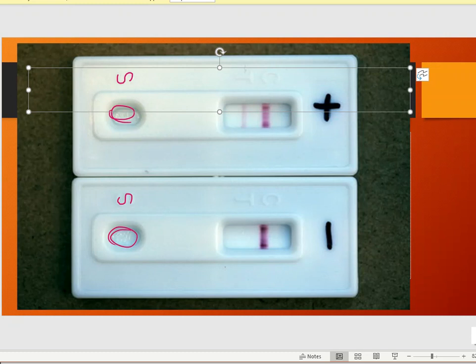What you're seeing here on the bottom, this is a negative test. Again, it's very similar to a pregnancy test that you would do maybe at home. The sample will be sucked up, and slowly, slowly, slowly, it will go up this absorbent. And then here at the very end, we have a control band. That control band has to show up. That is a very good sign that this has taken my sample, and the sample has made its way up to the end of this absorbent pad. So this will always be a positive signal every single time.